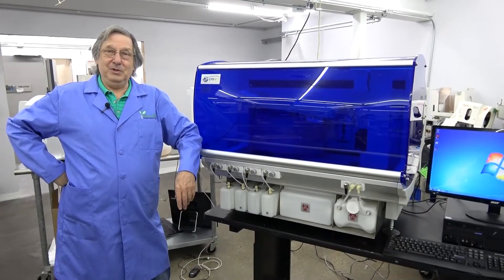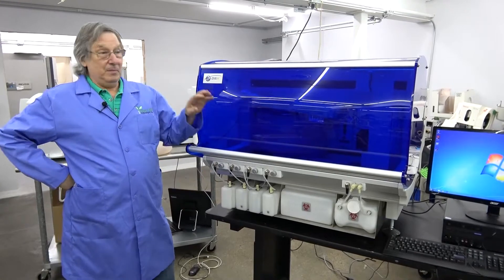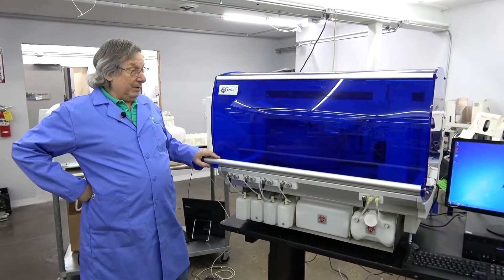Hello, welcome to New Life Scientific. Today we want to talk to you a little bit about DSX for ELISA liquid handlers.